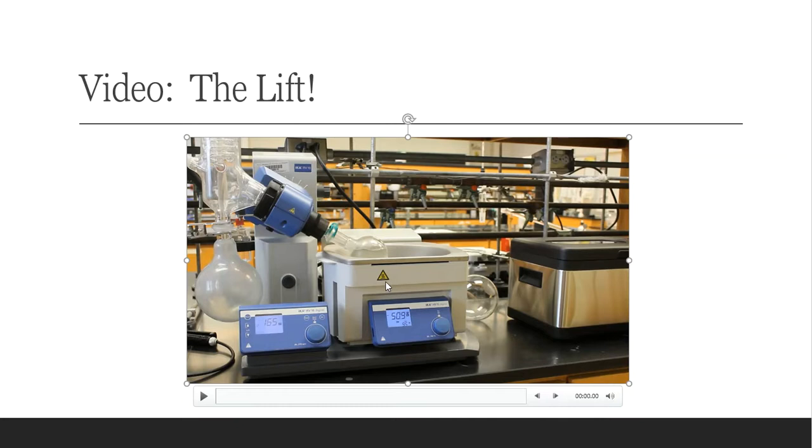And guys, what you just saw was the rotovap at its finest. That's all that this sucker does. And these things can cost $8,000, $10,000 a piece just because of its convenience. You can also hook up a vacuum pump to it. A vacuum pump will lower the pressure so things boil at a lower temperature for you. So there's a couple of different things that you can do.